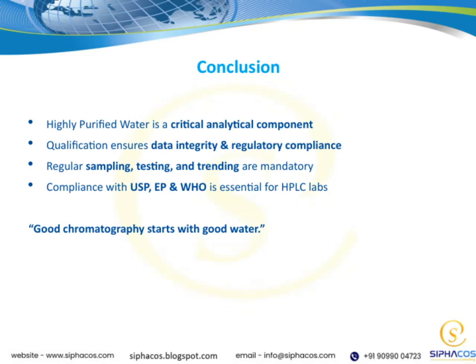So, to wrap things up, I want to emphasize that highly purified water really is a critical component in our analytical work. It's not just about having clean water. It's about ensuring the accuracy and reliability of our results. Proper qualification of the water system guarantees data integrity and helps us stay compliant with regulatory standards. Remember, regular sampling, testing, and trending are mandatory practices.